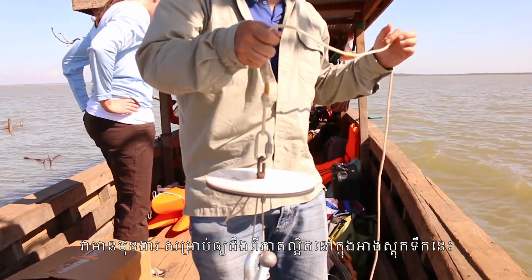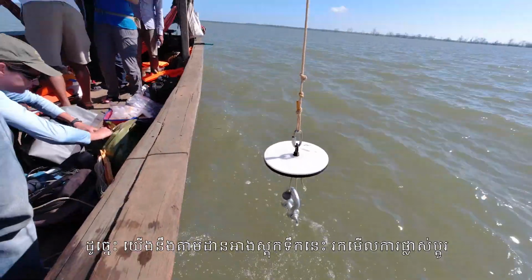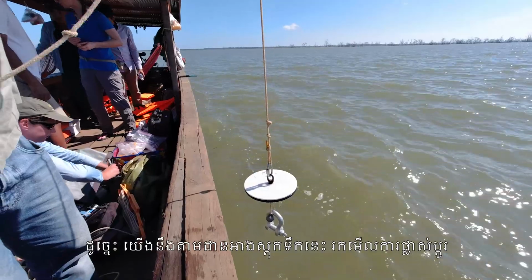Okay, this is a Secchi disk we use to measure the clarity of the water, basically to understand the particles in the reservoir. So we monitor the reservoir over time. We can see the change.